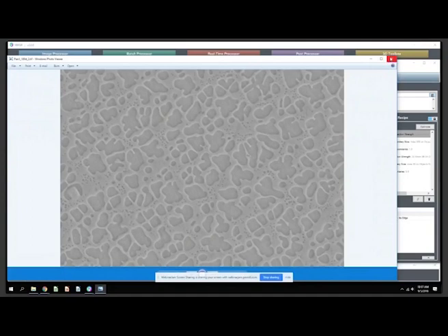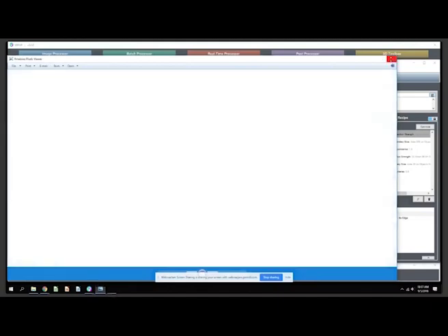And we then use some marking tools that we're happy to go into details of if you're interested in, things that look at contrast relative to the image scale and can find the darkest patches in the image relative to itself, and then keep what's inside the edge found boundaries as particles. So a combination of those marking and edge find tools let us tackle this challenging problem where, despite what your eye might think, the interior and exterior of the particles are roughly the same gray value. So that's really what this controls.